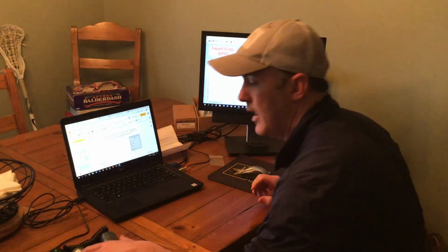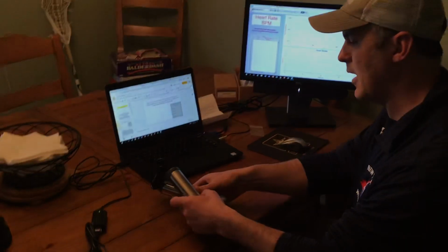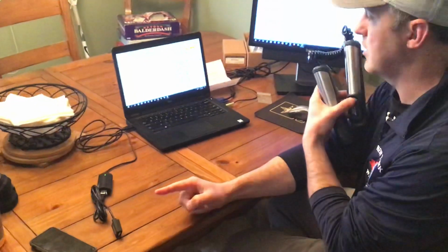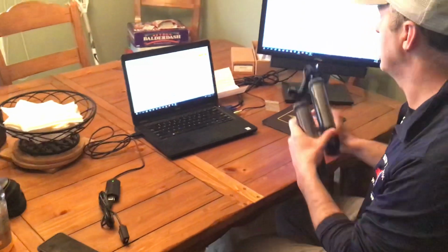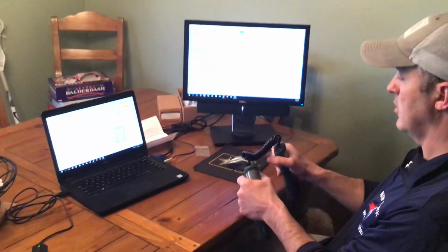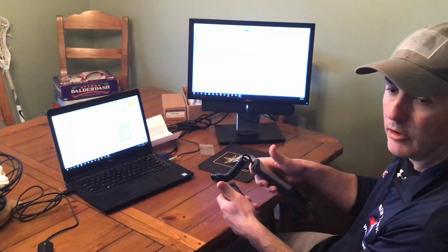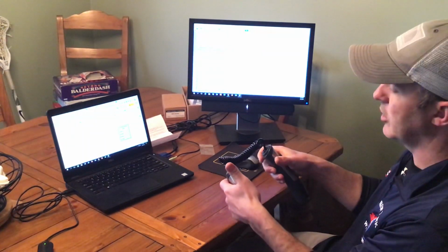Okay, so I have my Go Link set up. I have my sensors that are hooked to Bluetooth that connect right here. So it's kind of a little wireless system. And what they want you to do is put your palms on the metal the same way you would at the fitness center when you're using the ellipticals or the treadmills.